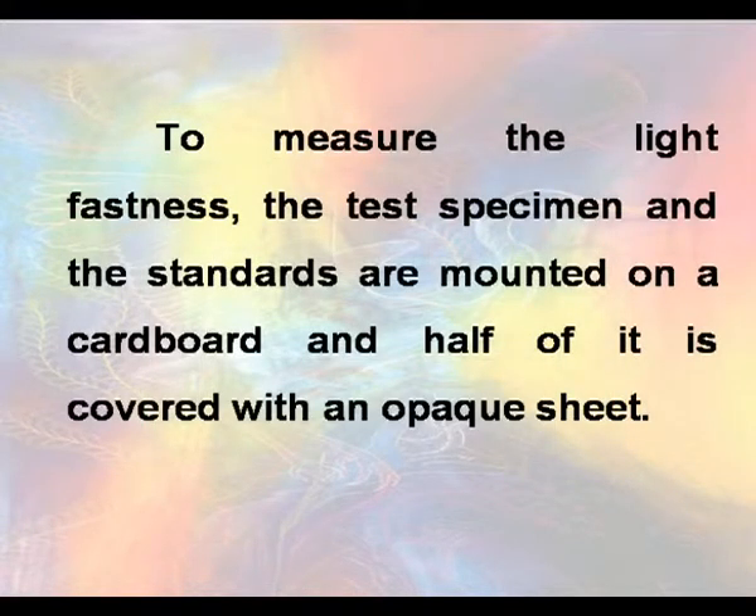To measure light fastness, the test specimen and the standards are mounted on a cardboard and half of it is covered with an opaque black paper sheet.